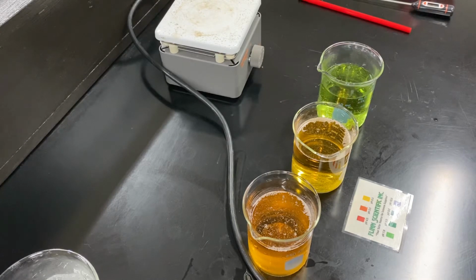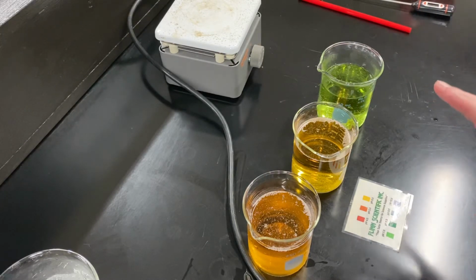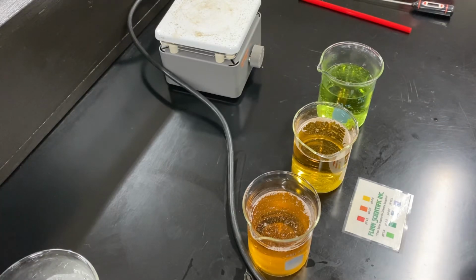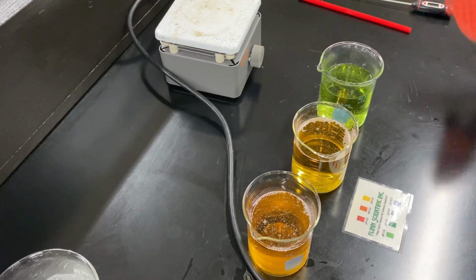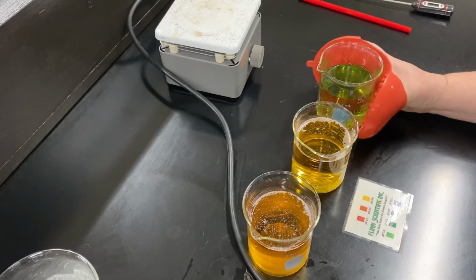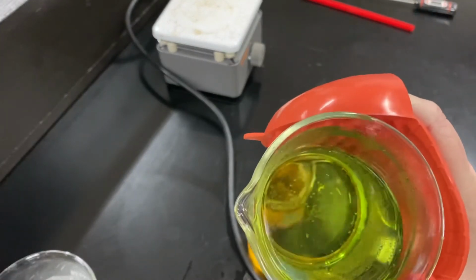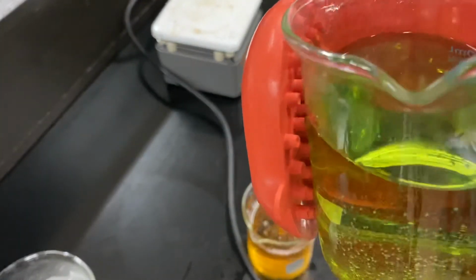Okay, now what I want you to look at is we need to determine which ones are saturated and which ones are unsaturated. Remember, a saturated solution dissolves as much as it possibly can. Okay, and a lot of times that means we have some of the solid left over. So if you look at the hot water treatment, you see no solid left over.